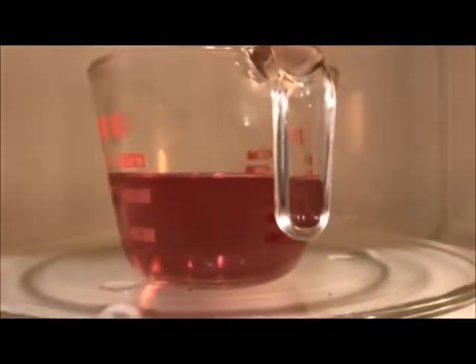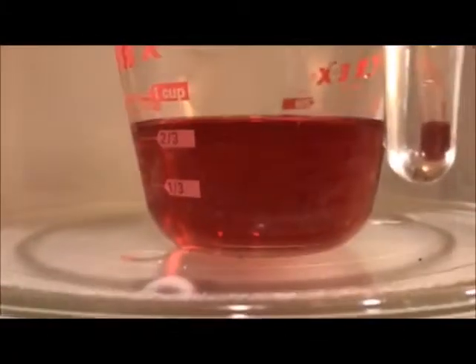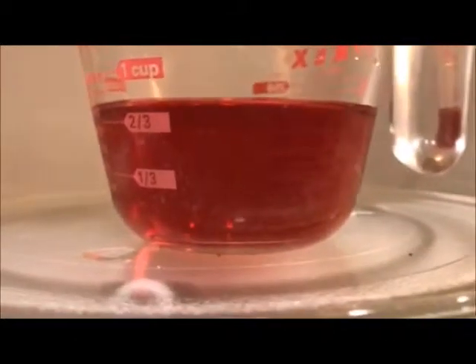You will notice that the color will be getting darker. The solution will form a dark, deep red, and that's what you want. But I'm going to cook it up just a little bit longer because we want a nice deeper red than this. Alright, your ruby gold colloid is ready.